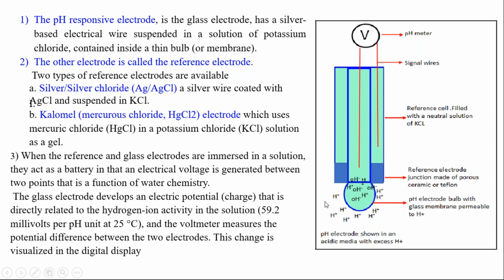The electrodes must always be suspended in potassium chloride. So the electrode should always be generally in saturated potassium chloride, which is 3 molar potassium chloride. And the bulb should not be exposed. You should not allow the potassium chloride to dry. Ensure that there is sufficient potassium chloride.